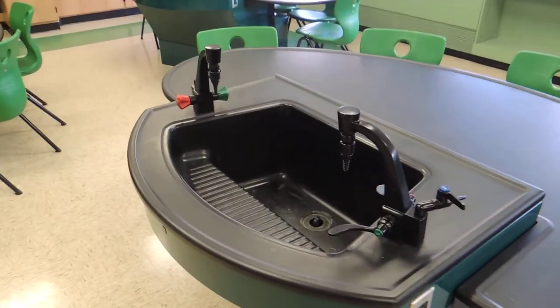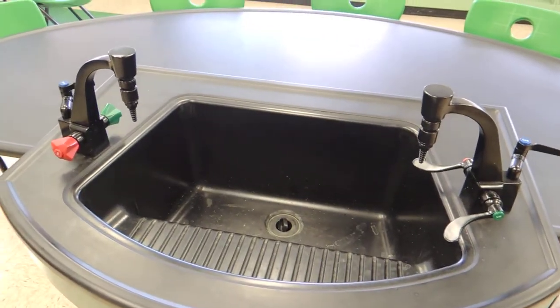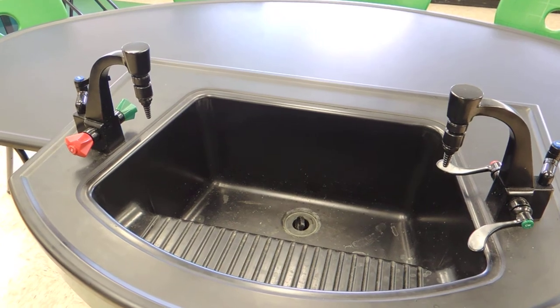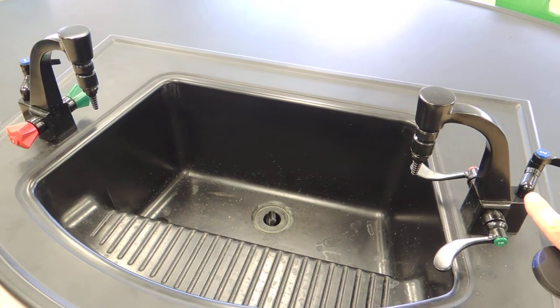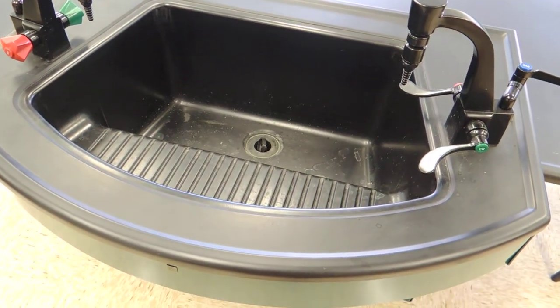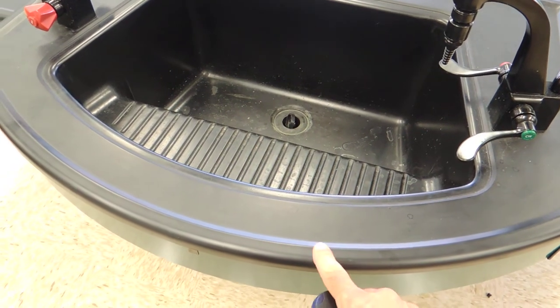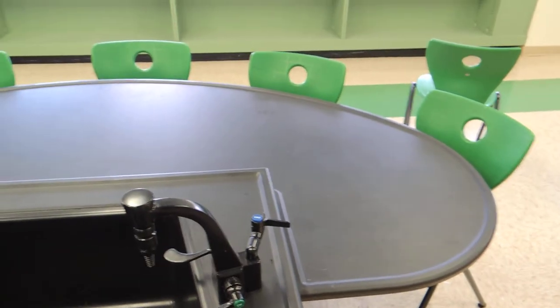As you can see, a large deep sink with the reagent rack tray built right in and two unicast fixtures — one-piece cast brass fixtures. Notice the molded marine edge also around the student work area to prevent spillage.